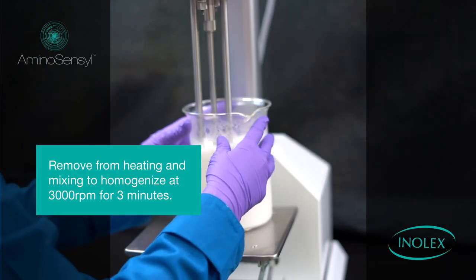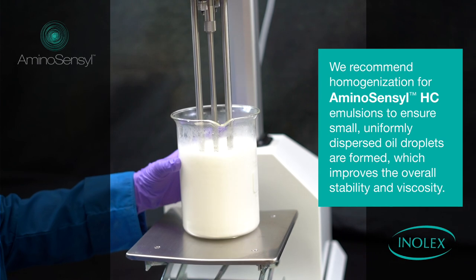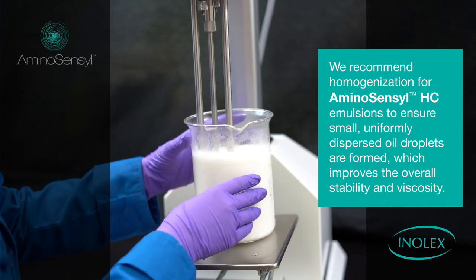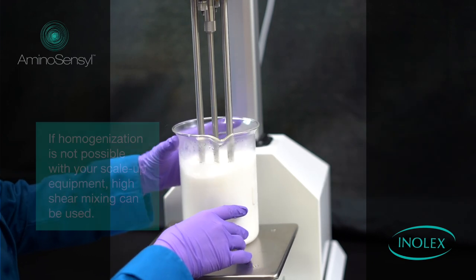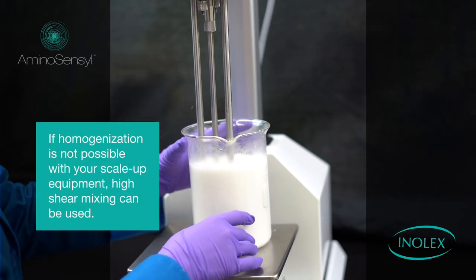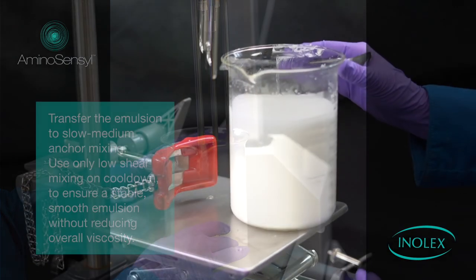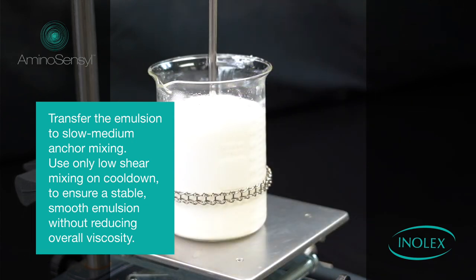Homogenize at 3,000 rpm for three minutes. We recommend homogenization for all Aminosensil emulsions to ensure small, uniformly dispersed oil droplets are formed, which improves overall stability and viscosity. If homogenization is not possible with your scale-up equipment, high shear mixing can be used. Transfer the emulsion to slow medium anchor mixing.